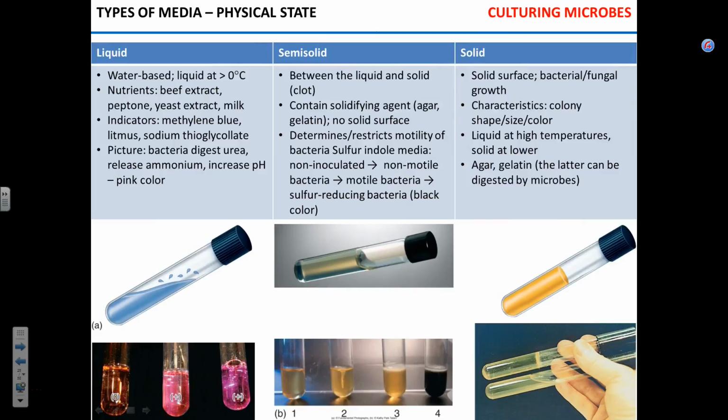Based on the physical state. So the one that you worked with, the agar, okay? TSA agar is solid. It has several very, very important features.